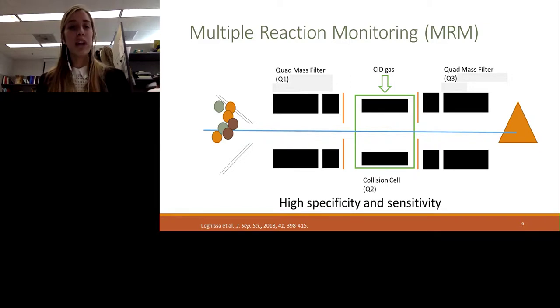As you can see, we have on the left of the slide 3 different balls with 3 different colors. In real life, these balls represent different ions from the same molecule that are formed in the ionization source. Once they are formed, these ions will start passing through the first quadrupole that actually works as a filter. So it will allow only one ion, in this case one ball, to pass through the second quadrupole. The second quadrupole is not a filter, but a fragmentation chamber.